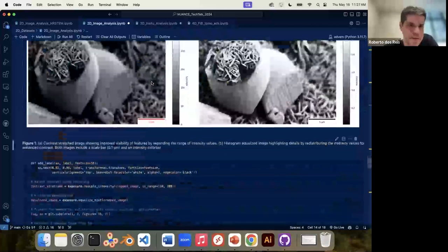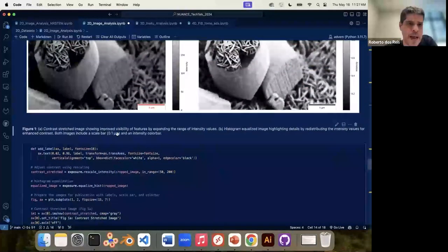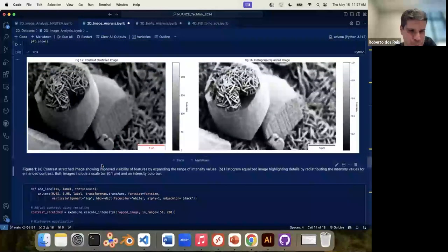So continue on. At the bottom, if you want to add, for example, a caption, right? So here I added it as a markdown on the Jupyter Notebook. When you export as a PDF, for example, that looks like a caption, right?